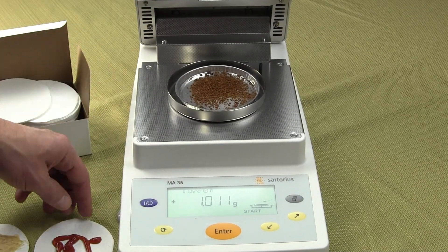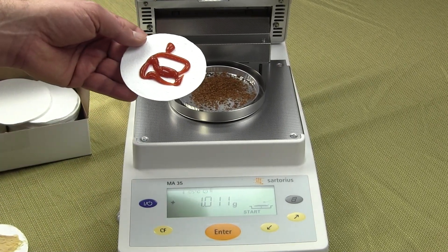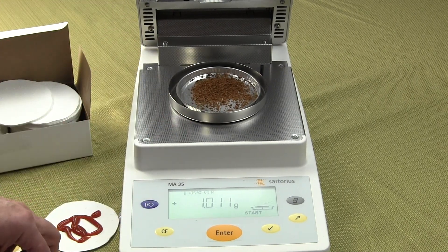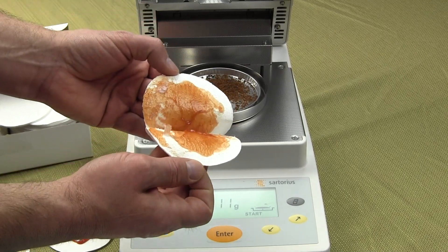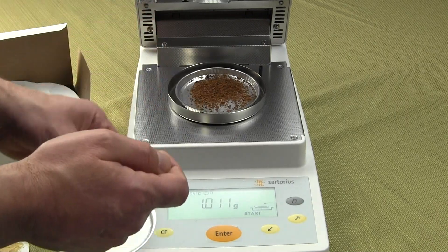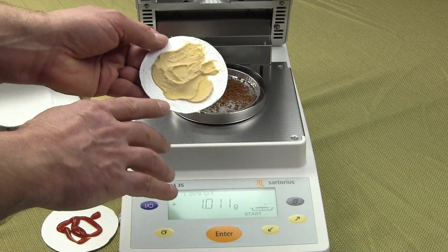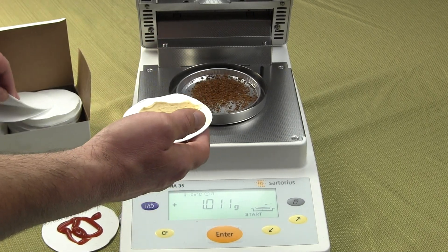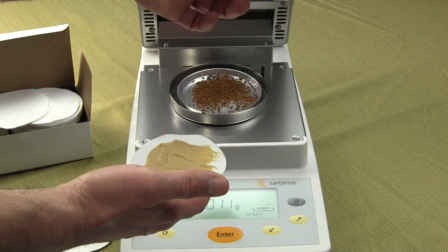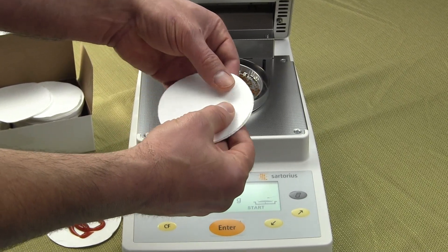Now if your sample is a sludge or something that's going to spatter when it heats up, you want to use filter pads. Here I'm using ketchup as an example. You'd put your ketchup on the filter pad, then place another filter pad on top and do a squish and roll — this is what it should look like: nice and spread out. You'd then place these filter pads on your pan, tear it out, and run your test. For anything creamy or chunky, you'll notice the rough side is where the sample goes, and again the smooth side faces up on the top filter pad.